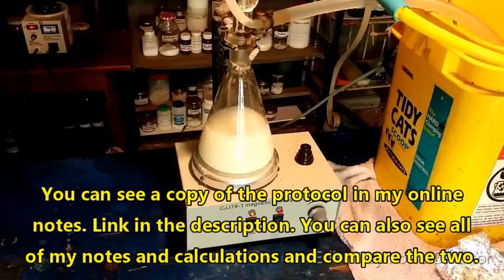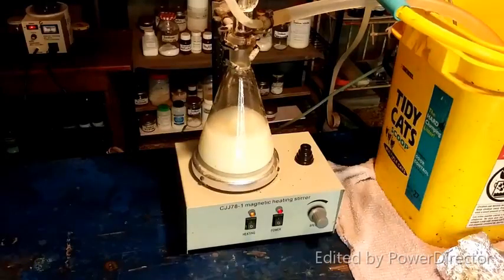I'm going to let it keep going here for another few hours, and then I will shut it down. Then it's going to get real interesting because the weekend is about here, which means that my work schedule is going to be crazy, and I have to do the workup with this. I need to distill some ether still, so I've got to get busy with that.